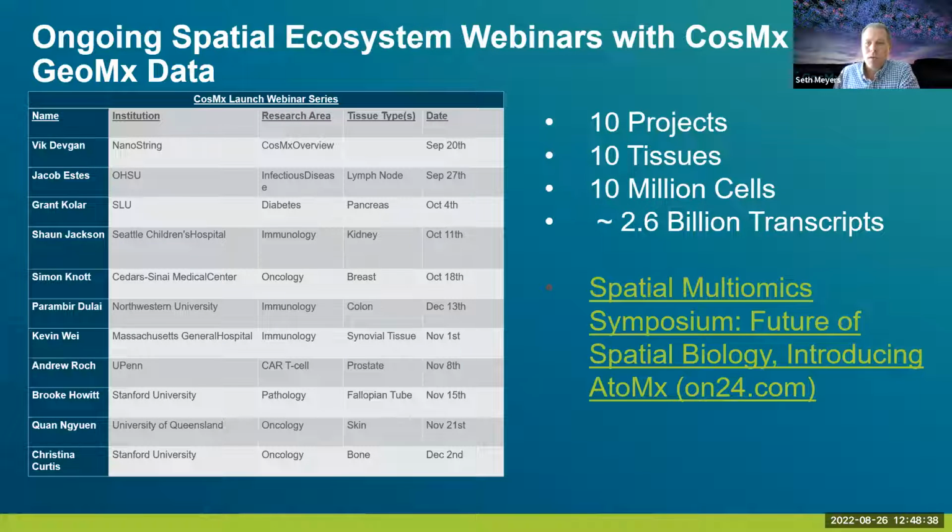Luke has a question around the general guidelines for powering a single cell spatial experiment using the system, like number of cells, but also biological samples. I don't have it here, but there's a great white paper that goes through experimental design that I'm happy to share with the team. It talks about thinking about the number of samples that are going to be used, and what the spatial question is that you want answered. I'd be happy to share that slide that we have around that as well.